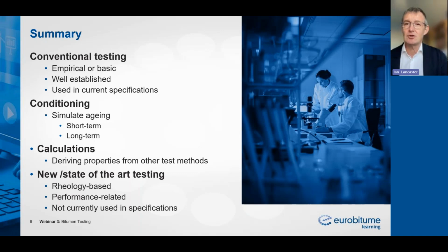We can look at short-term aging, which is the aging which is induced as we would expect in an asphalt mixing plant, or we can look at long-term aging, which is the sort of aging that the bitumen would experience when it's in a road, for example.